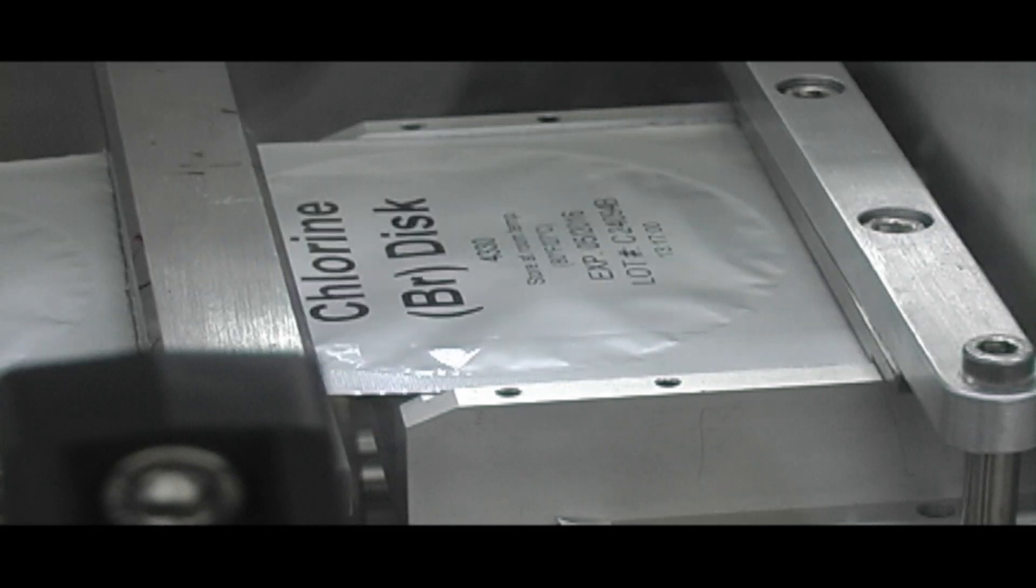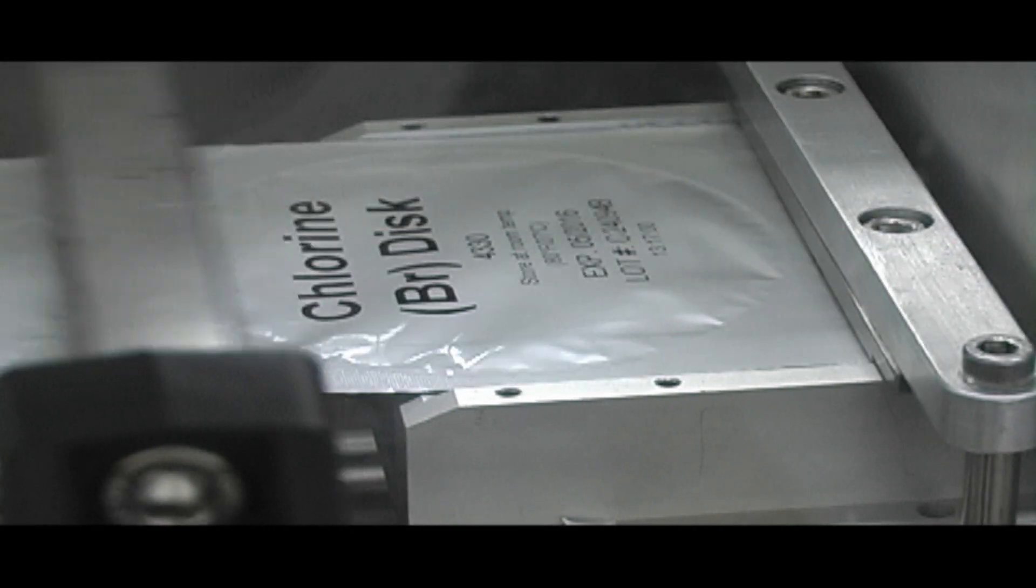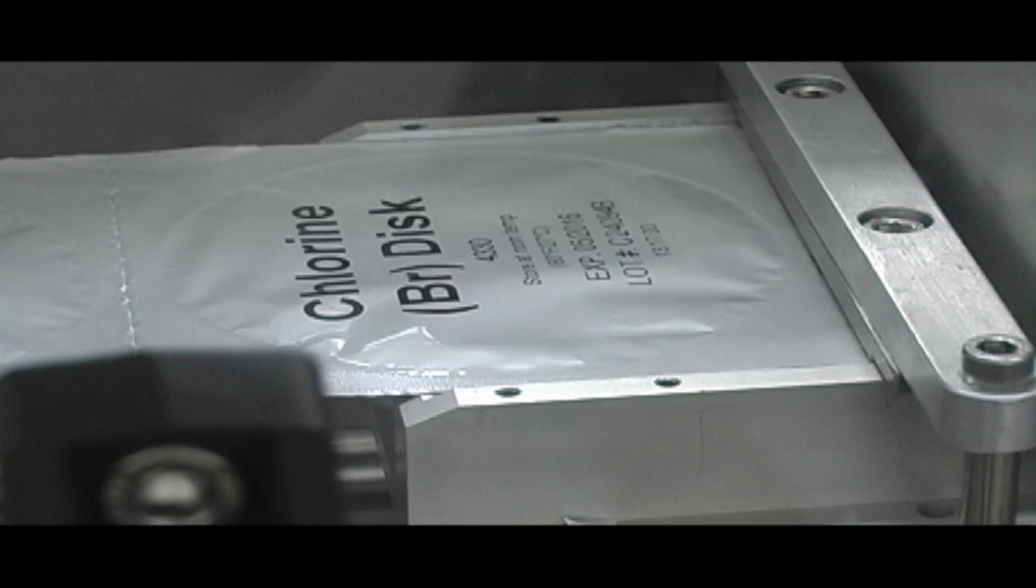Finally, each disc is individually sealed into a foil pouch with desiccant to prevent moisture or light from compromising the reagents.